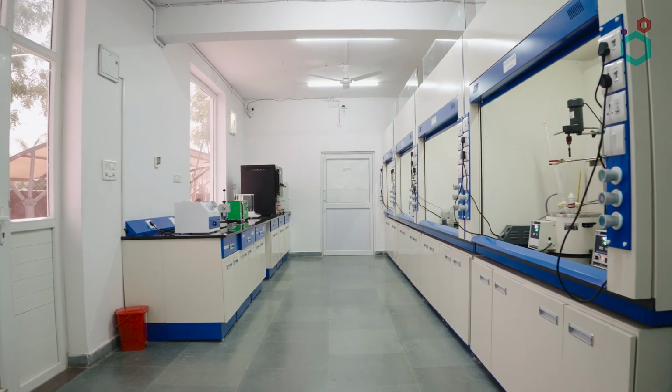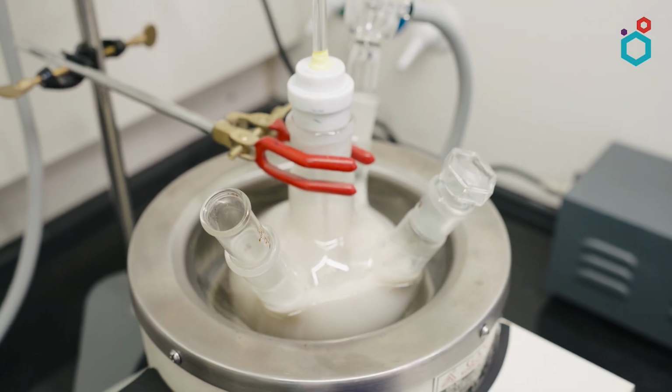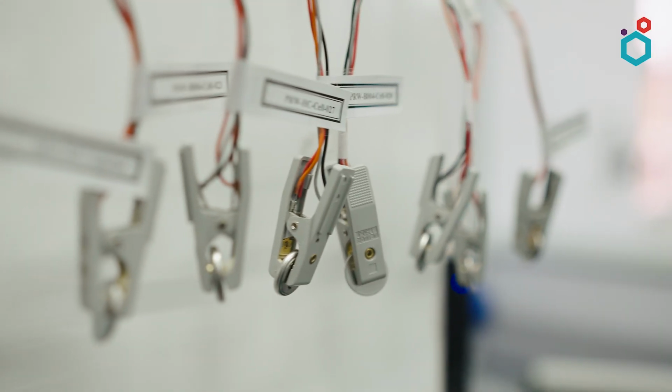So after about a year of refining our own synthesis process for Prussian White, we decided to set up a dedicated battery R&D lab. And now here we are. In this newly set up R&D lab, we can handle everything from synthesizing Prussian White to making and testing coin cells and pouch cells. This setup allows us to constantly improve the material, its stability, particle size, sodium content, water content, all of it. We built this lab in just 3 to 4 months, and honestly, it feels like pretty decent progress in such a short time.